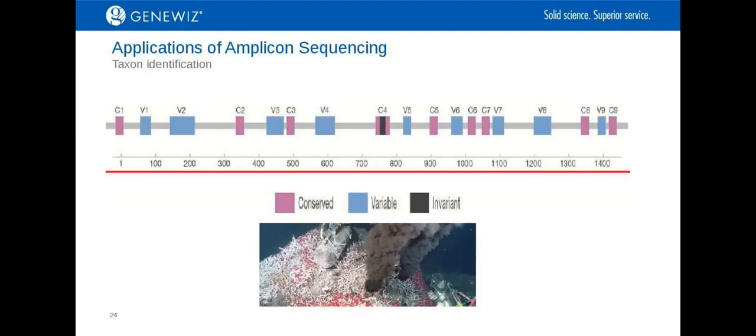Below is an example of an underwater heat vent where extremophiles may be present. If said extremophiles do not have a well-defined hypervariable region for 16S analysis, how do you go about analyzing this? So one way would be to amplify the entire 16S gene and sequence this using long-read NGS technology like the PacBio Sequel, which can have read lengths, like I mentioned in the previous slides, up to 100 KB.